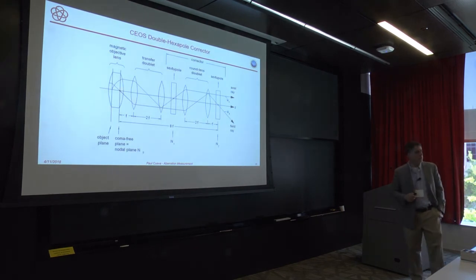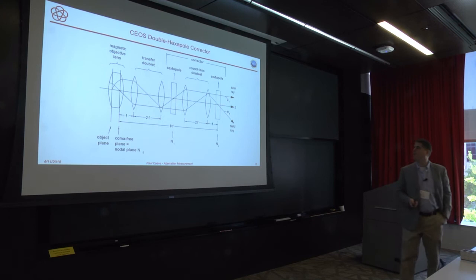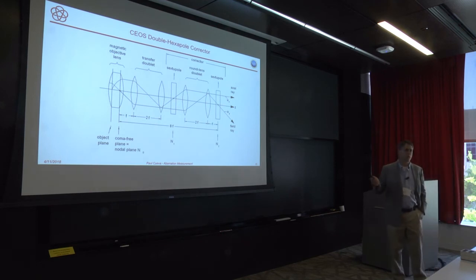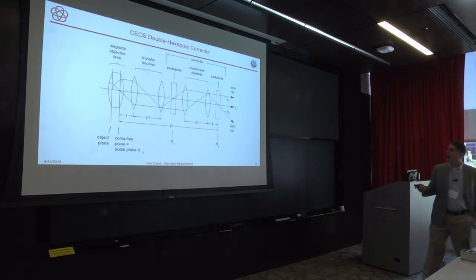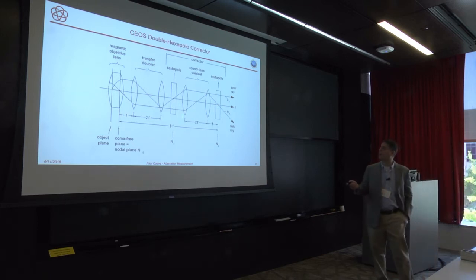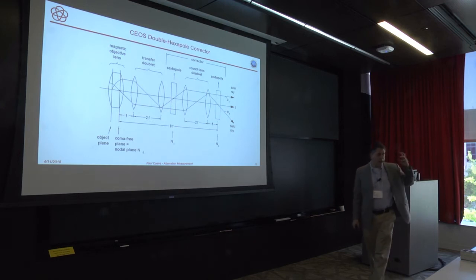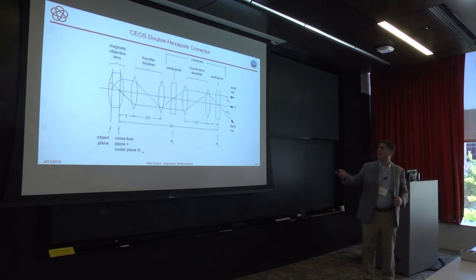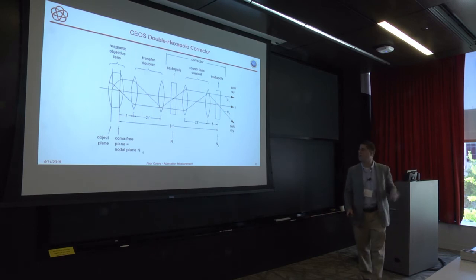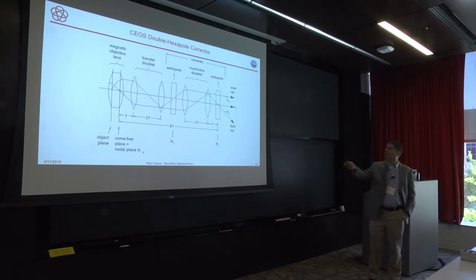Now, how does this connect to storage rings? Well, when you're doing your lattice elements in your storage ring, and the way you're tuning and fixing things up, you're using a lot of sextupoles or hexapoles, depending whether you want to be Greek or Latin. And the sextupole is the key element we need for an aberration corrector. If I take a sextupole, it actually has a negative spherical aberration coefficient. That's a big deal because all my round lenses have positive spherical aberration coefficients. It has all sorts of other horrible aberrations that go along with it. So you can't just stick one sextupole in.